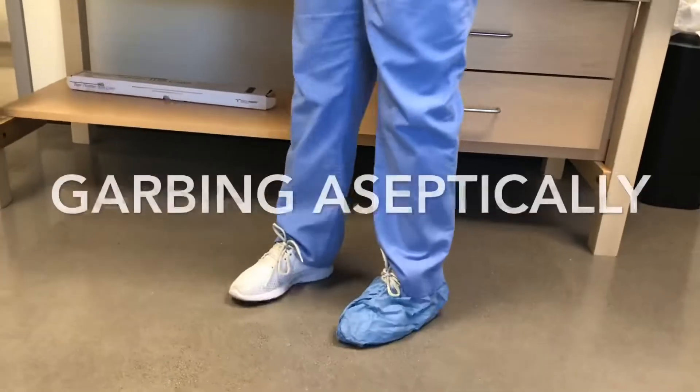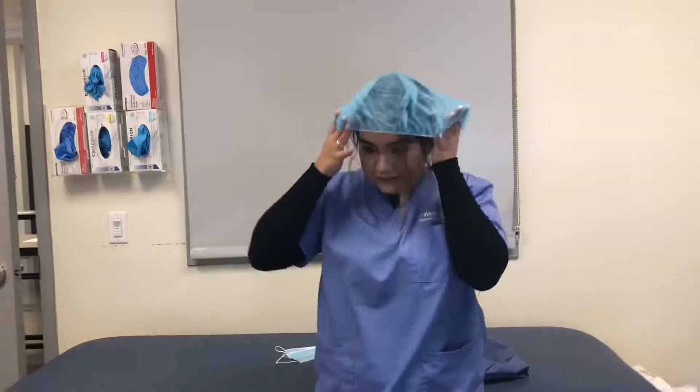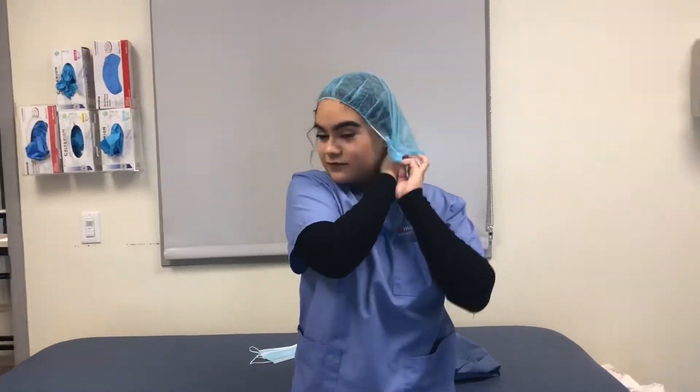Start off with your booties — put one over each foot. Then move on to the bonnet, making sure all your hair is inside the bonnet.